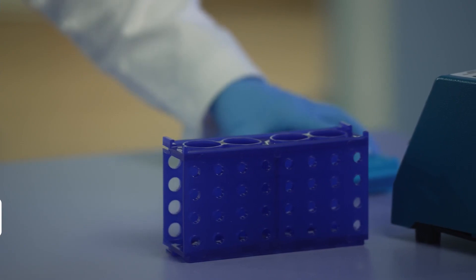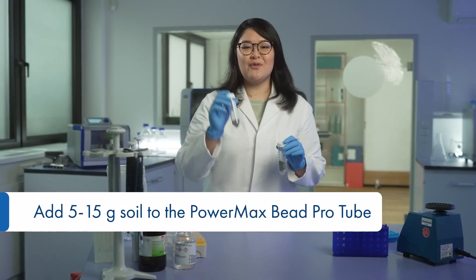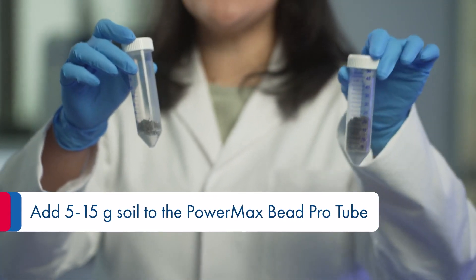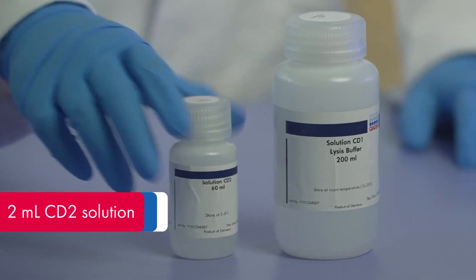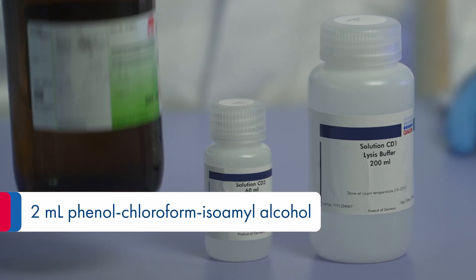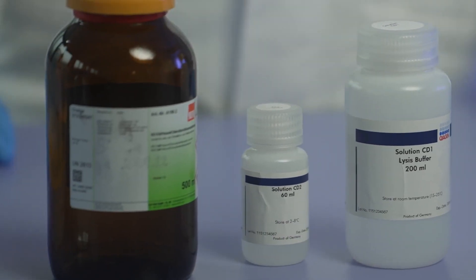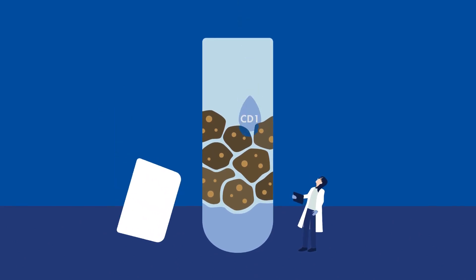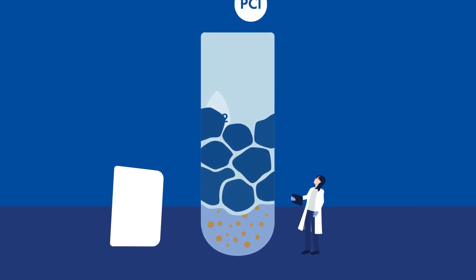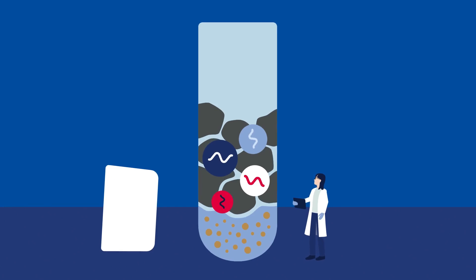Let's begin with the extraction. You can use any input from 5 grams to 15 grams of soil. Add solution CD1, solution CD2, phenylchloroform and gently vortex. Solution CD1 disperses your soil, solution CD2 eliminates the contaminants, and PCI protects your RNA from degradation.